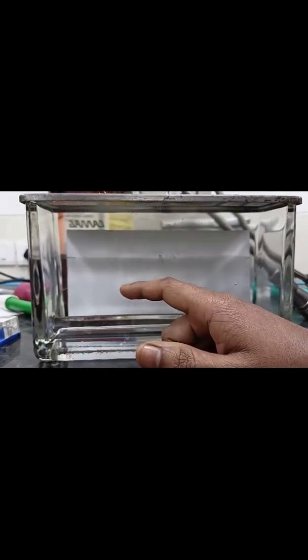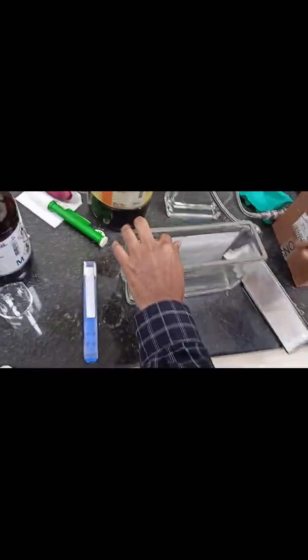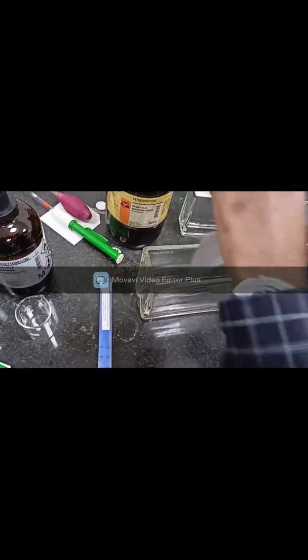Now you can see the solvent has reached the marked point. So it has moved 7 centimeter from the bottom. Now we have to remove this plate from the glass developing chamber. We should not disturb this part, the solvent traveled part. Now we will dry this plate using this dryer.